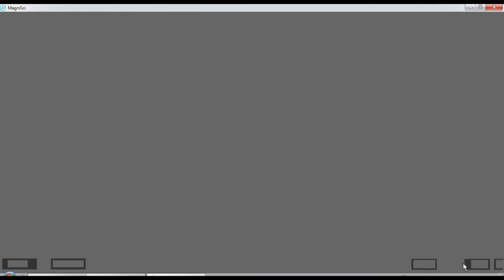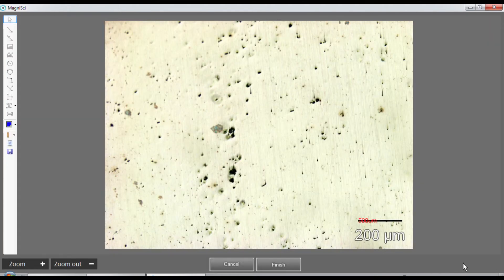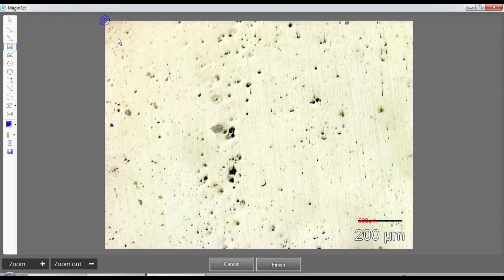We use the same calibration and go forward. Now we need to know the total area of this image, so I use a rectangular object - one click here and one click at the end - covering the same area that I chose for my particle measurement.